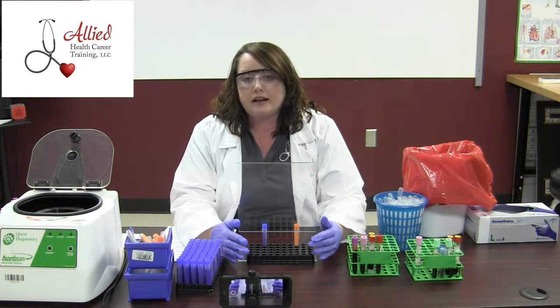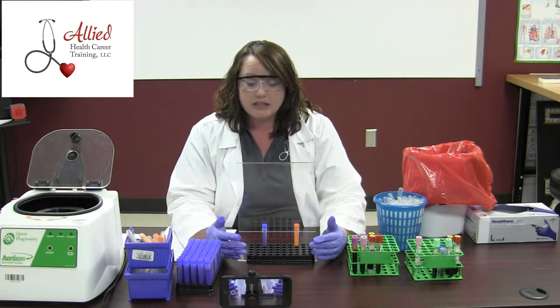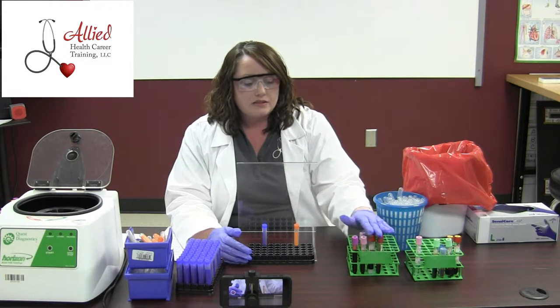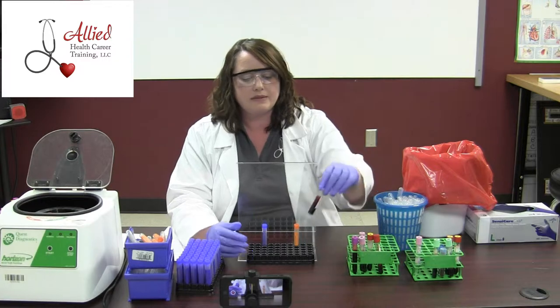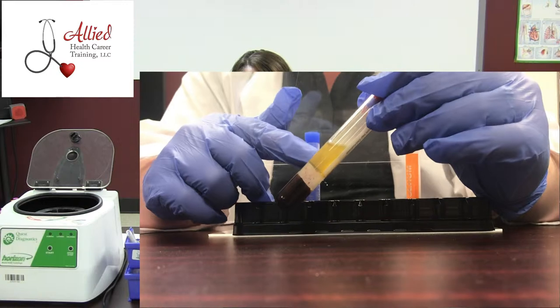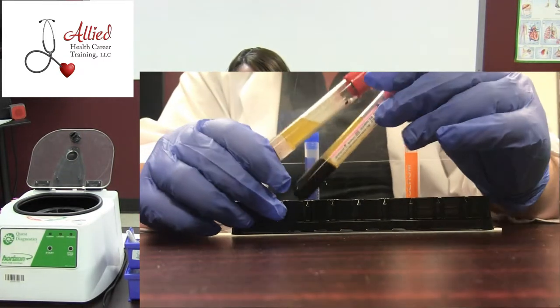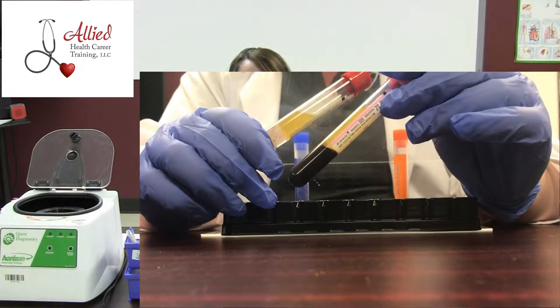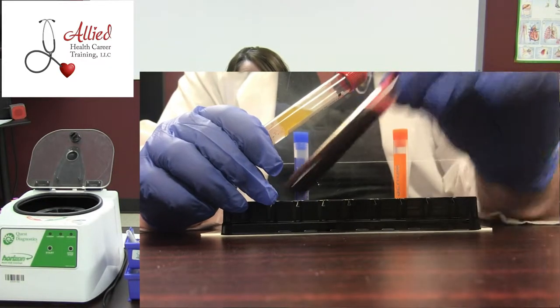Now we know that blood will clot naturally. If it didn't, any time that we cut ourselves, we would just bleed out and continue to bleed. So if we allow blood to clot or add a clotting factor to it and then centrifuge, what's going to happen is serum will form. This is usually what they're going to want to test — serum or plasma. For hematology purposes, we could still test whole blood.